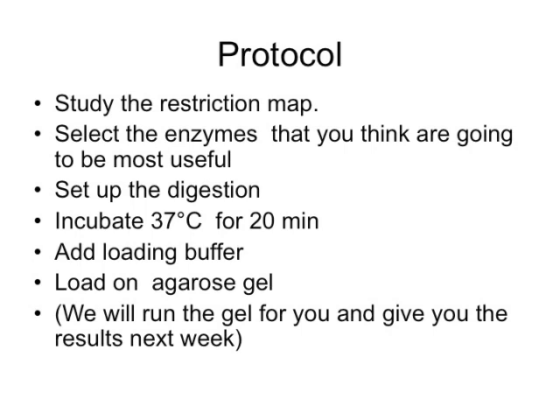You will then set up your digestion, incubate it for 20 minutes at 37 degrees C, and then add the loading buffer. You can then load that onto the agarose gels. Because of time restrictions, we will run the gels for you.